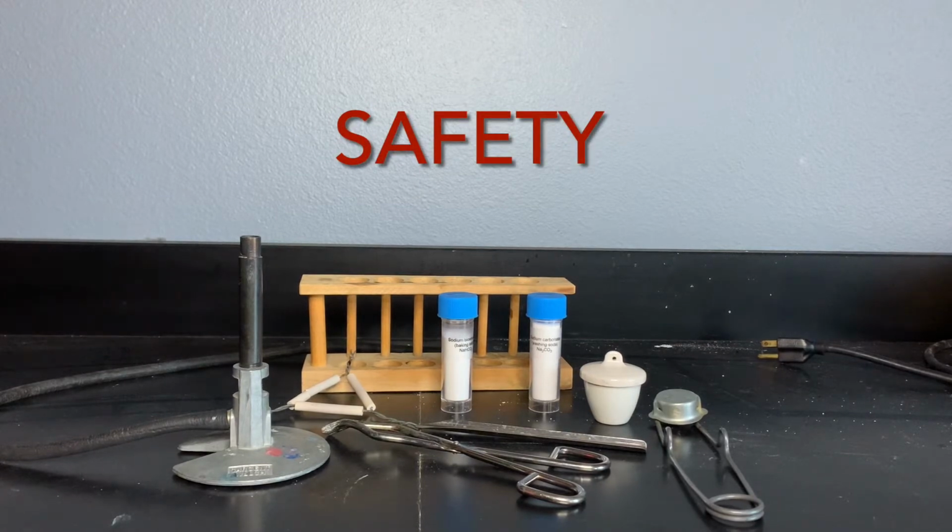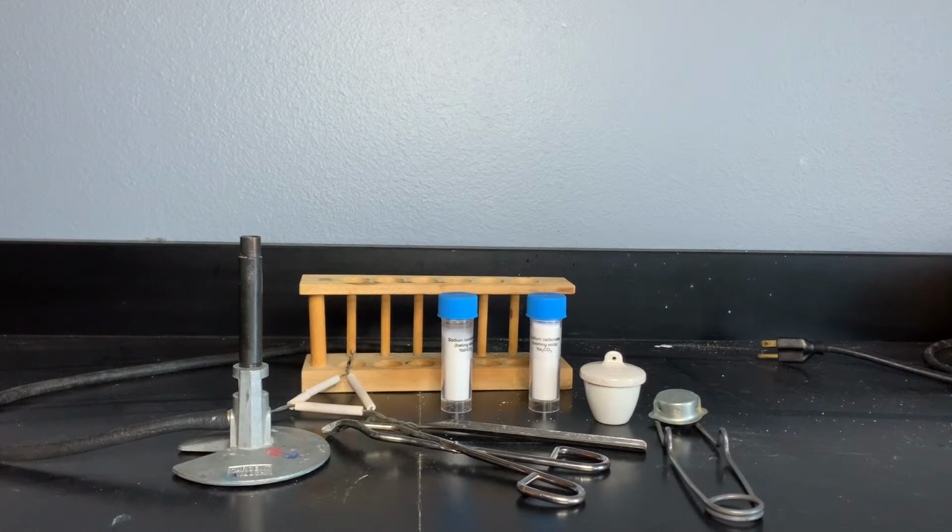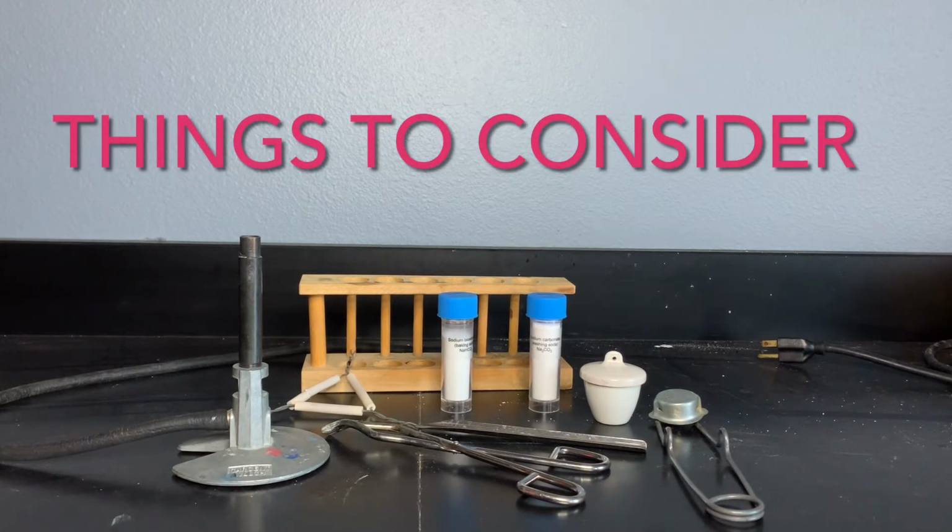Safety. Wear your goggles and maintain a safe lab space. Things to think about. Thermal decomposition of sodium bicarbonate will occur rapidly at 200 degrees Celsius, but the solid product of the decomposition will begin to decompose at temperatures over 850 degrees Celsius. So think about how hot those Bunsen burners run. Controlling your level of heat will be imperative as you do this lab.